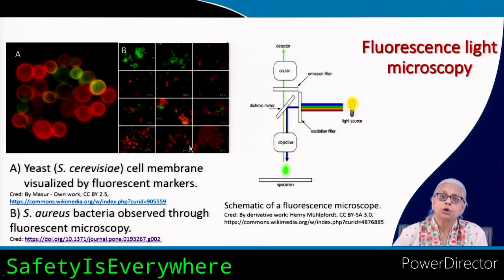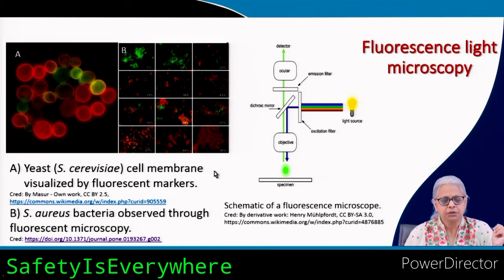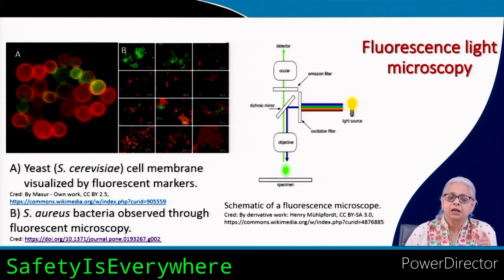So this kind of difference in the reaction of different cells to these dyes can be used to separate living cells from dead cells, and in this particular paper they have used image processing software to enumerate cells under these different conditions, and those are the numbers. That is the number of, I think, dead cells. Yes, I think it's the number of dead cells that are shown in these series of images, where the green cells are living cells and the red cells are dead cells.